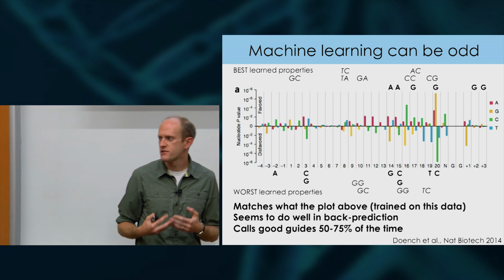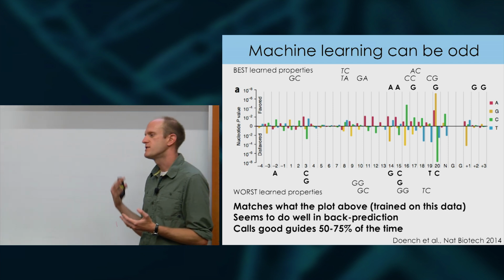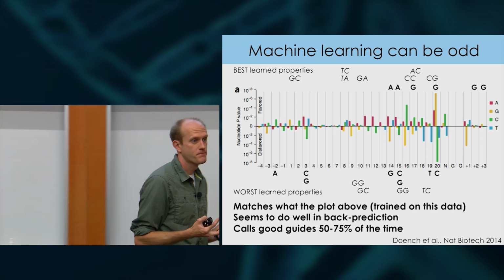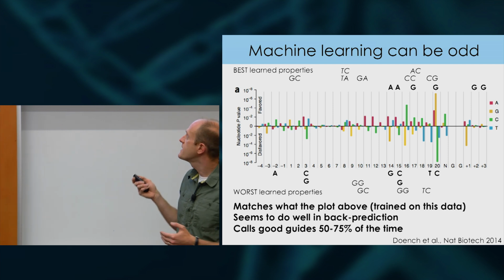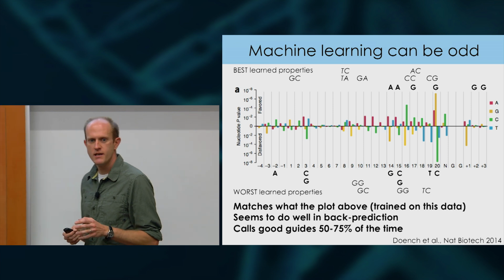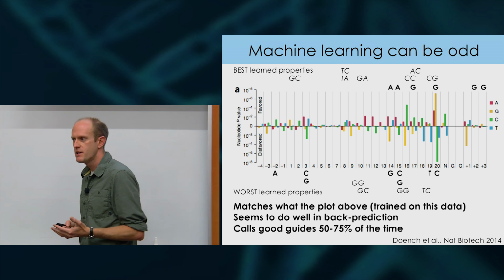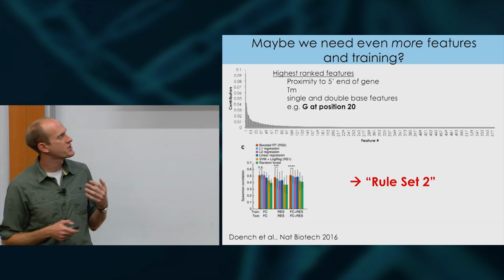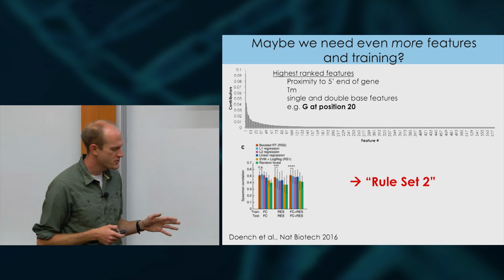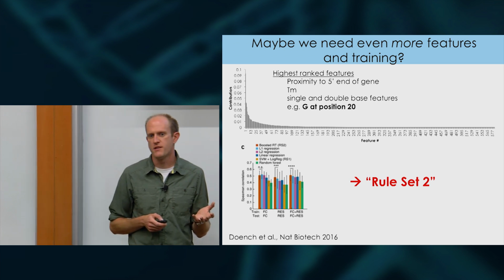So remember, it's a cutting data set. It's scanning across exons. It's looking in a certain number of cell lines. And since we're not talking about any kind of fundamental insights into the way Cas9 works, training works best in the way that you have trained it. Okay? So you have to remember that this data set is looking at cutting and knockout. And so it's actually not totally clear that training using this kind of training set for, say, CRISPR-I or CRISPR-A would actually be applicable. Because one of the major features in the next rule set, 2 years afterwards, that John Doench's group came up with was proximity to the 5' region of the gene. So whether you're in the first exon or not.